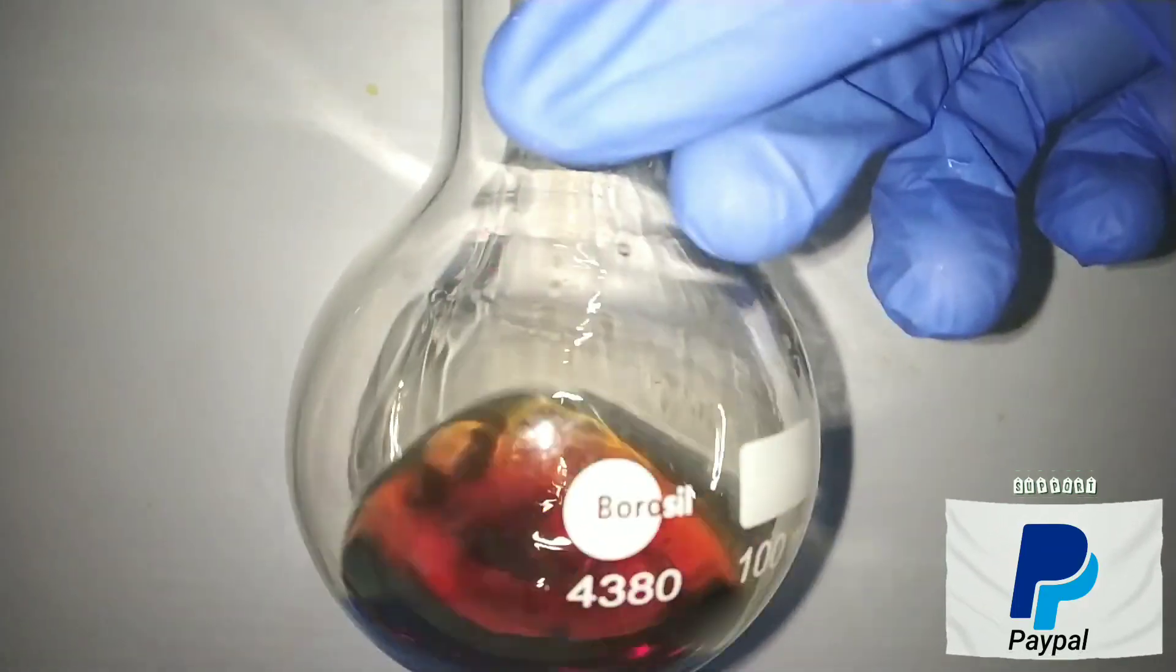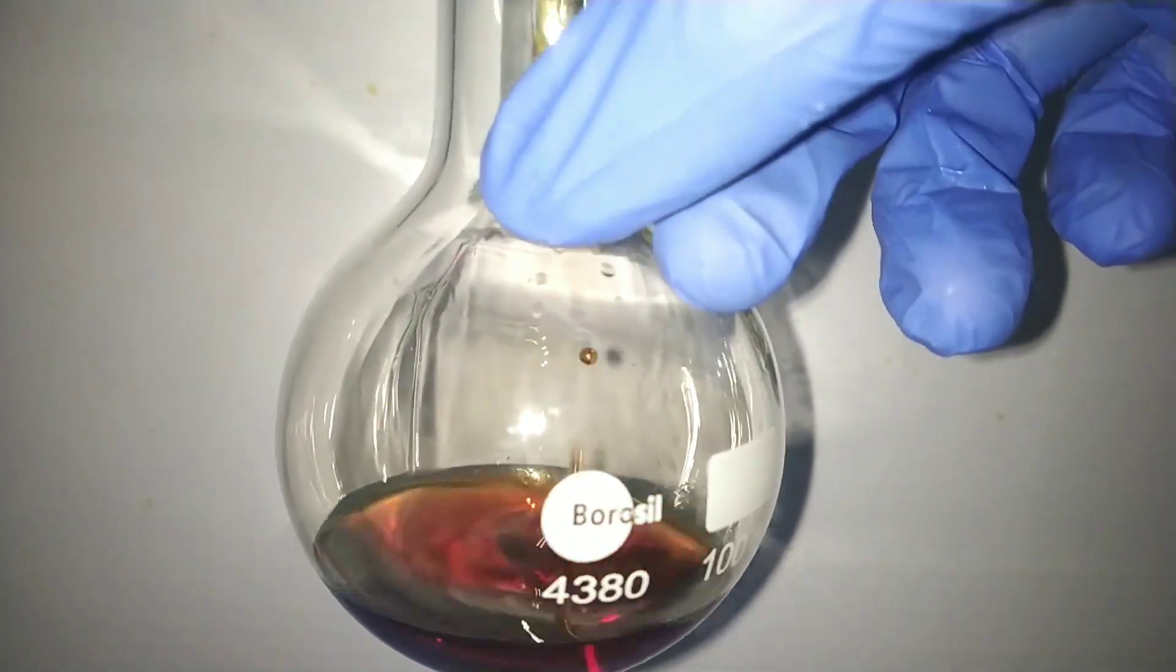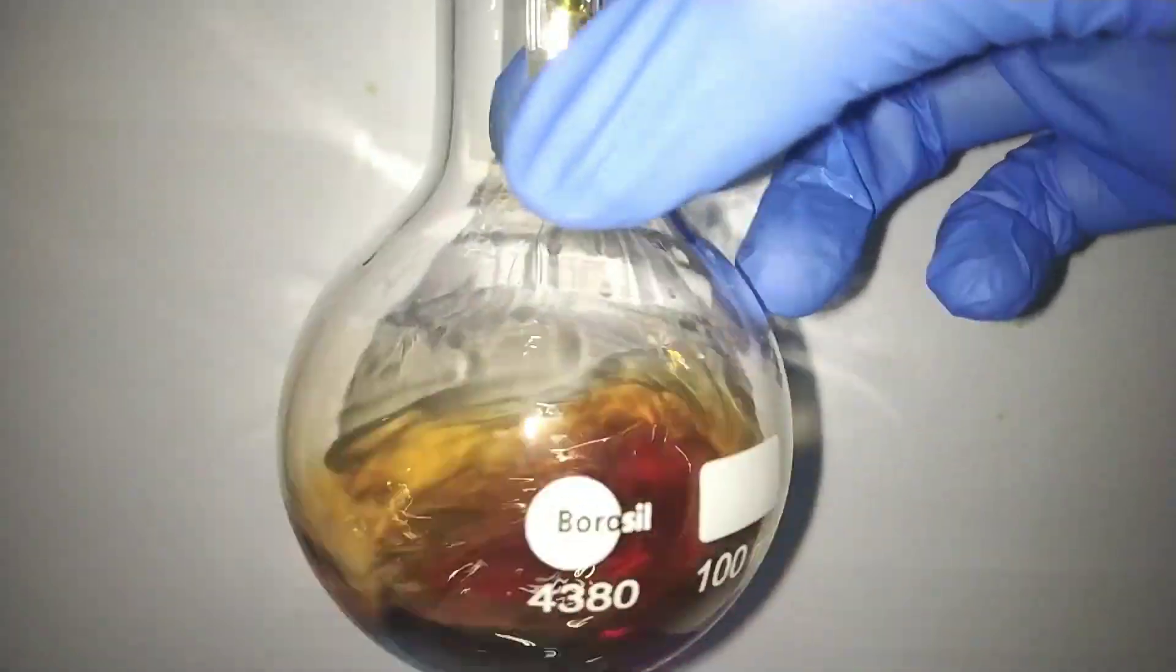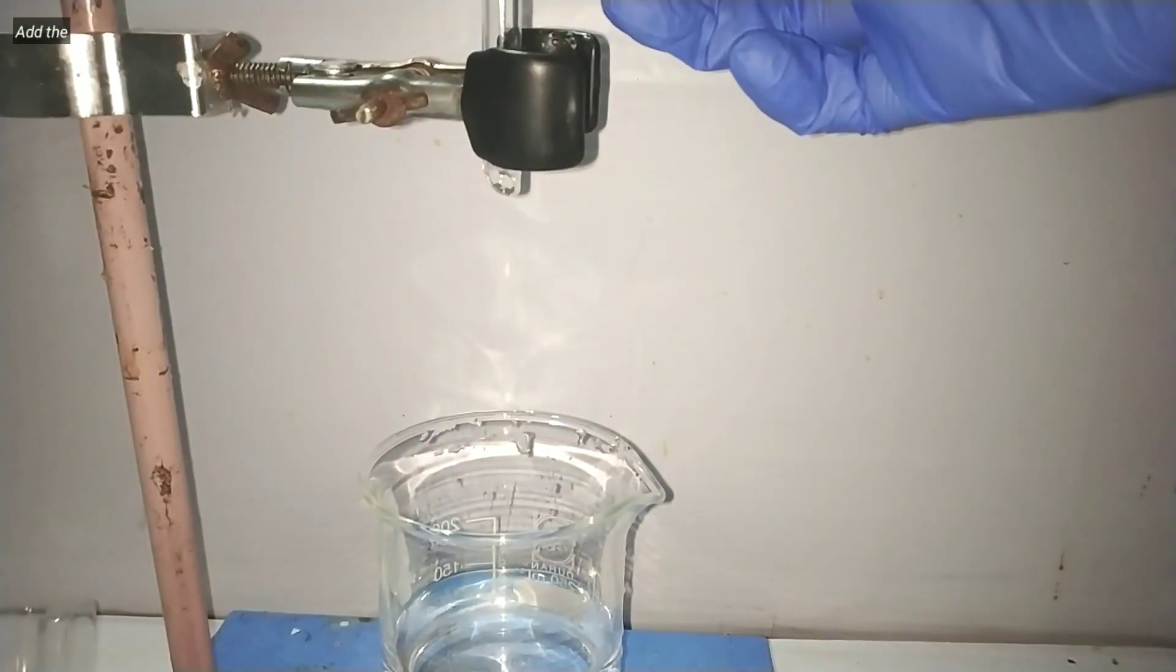After complete addition of the brominating agent the crude precipitate immediately separates out. But in my case the product remained dissolved in alcohol.